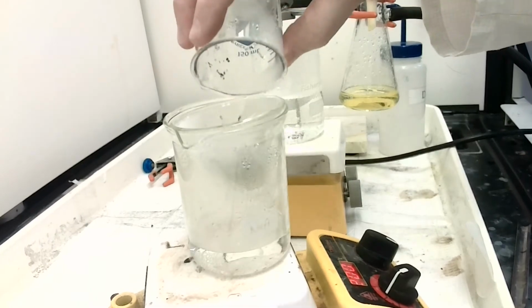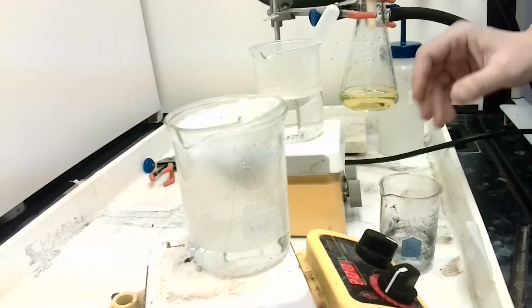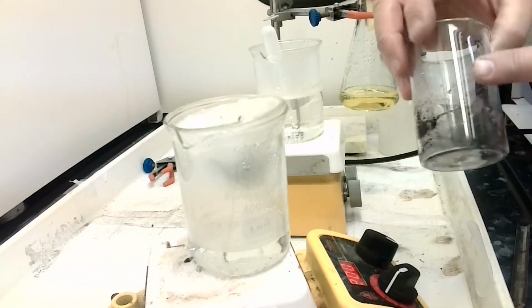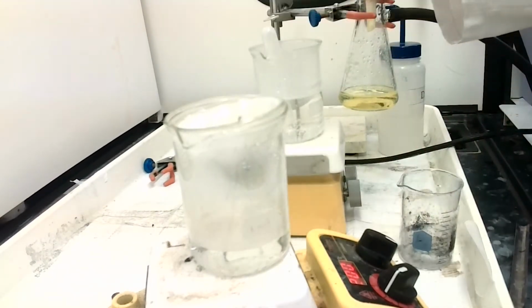You don't want some boiling water to the filter paper too? Yep, I'm going to. Okay, so I think I've transferred all I can from the crude beaker. It's now all in here.